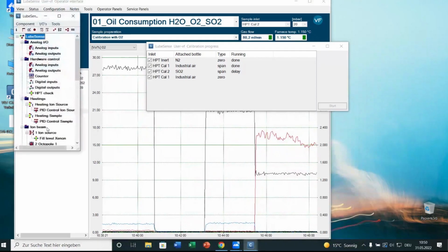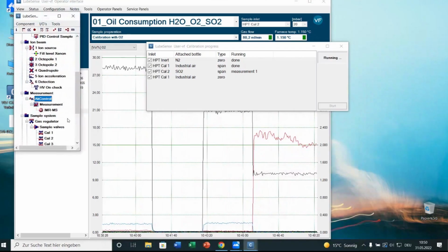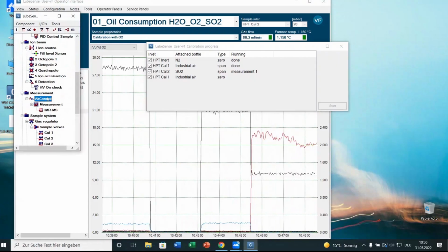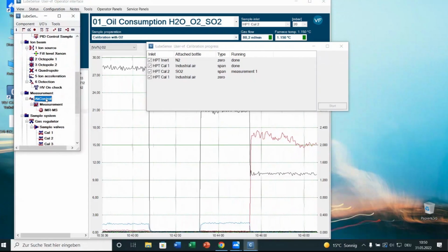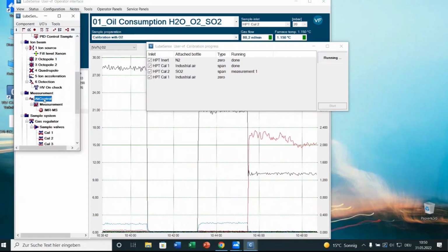And if the concept of analog signals is not the way you want to do things, we see here that the instrument also has the possibility to be controlled with the AK protocol.